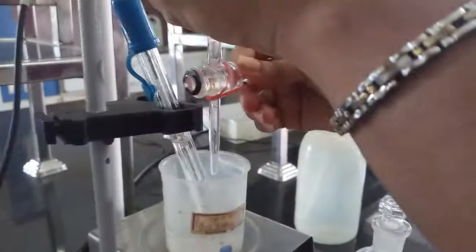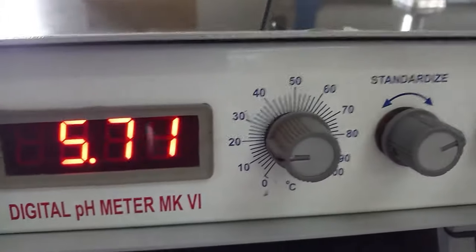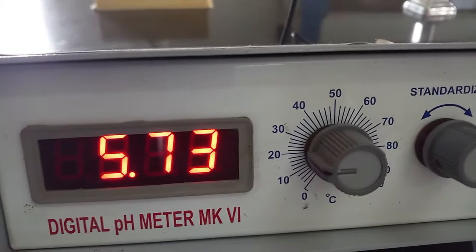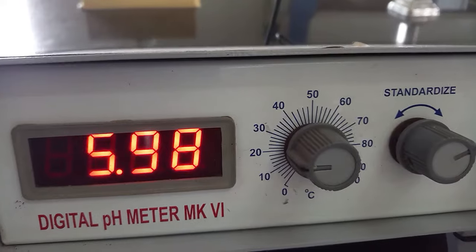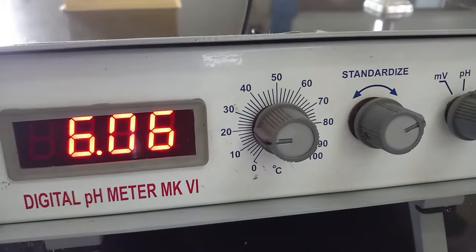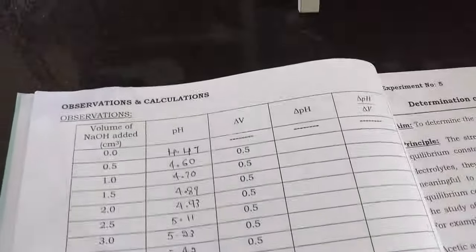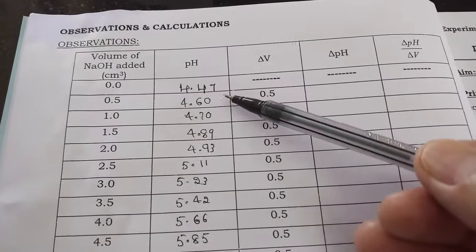Here you can see upon adding NaOH the pH is increasing. For every 0.5 ml successive addition of NaOH, pH is increasing, that you have to record. Now here you can see the value of pH is increased on adding sodium hydroxide.